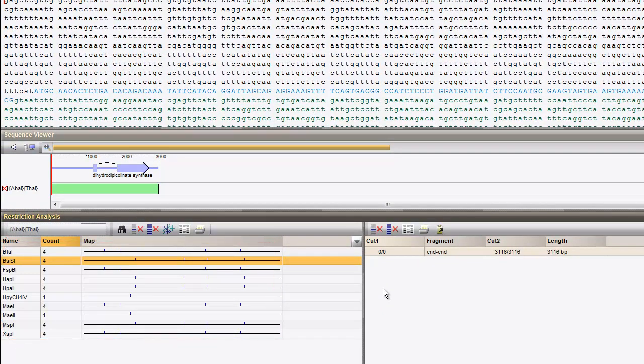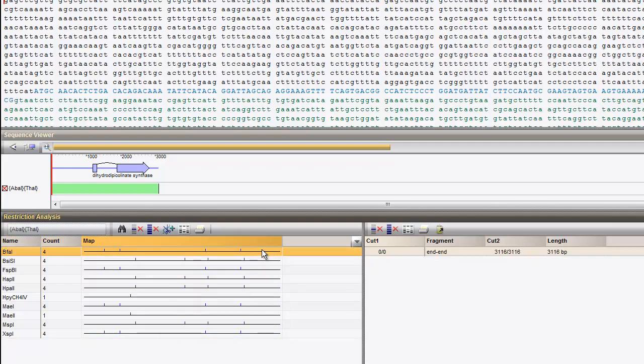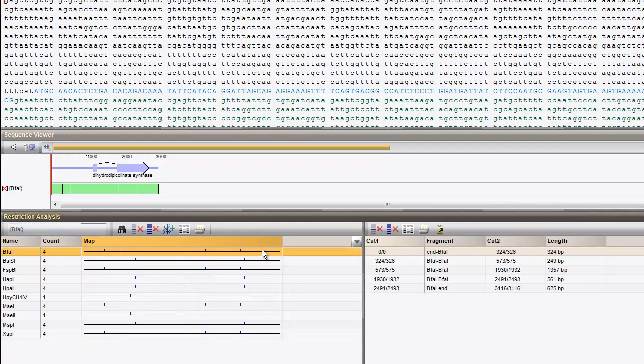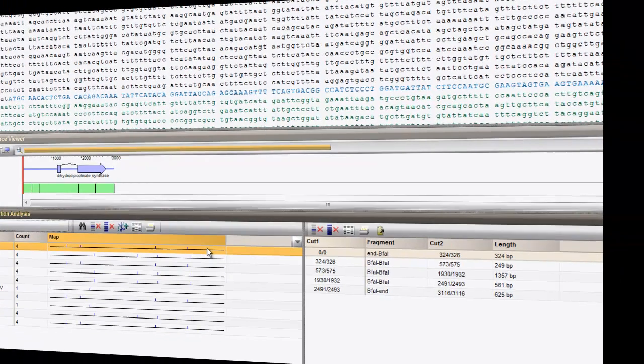Map an enzyme onto the sequence by double-clicking on it.